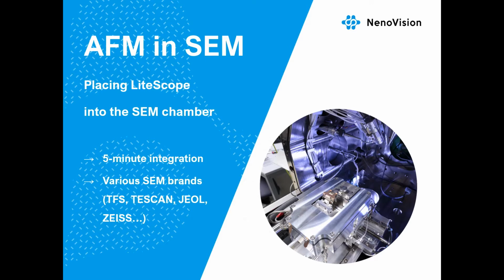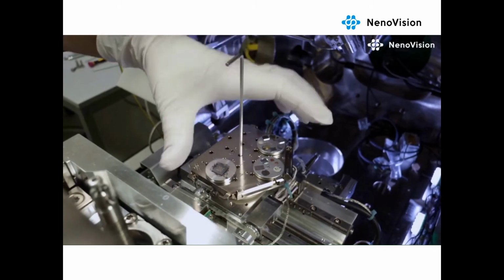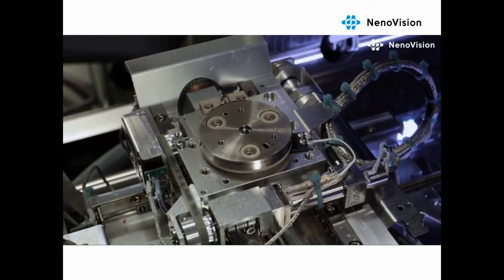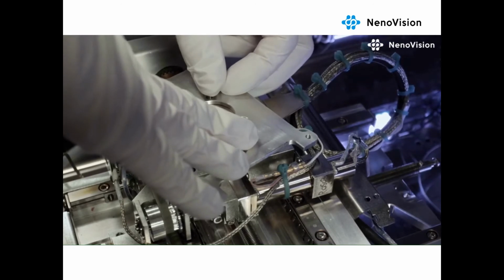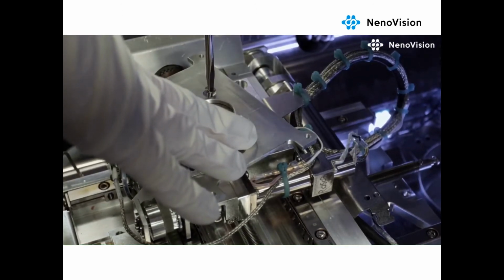Now let's have a look at how to do it. We are going to replace the SEM sample holder by LiteScope. First, we fix an adapter to the stage. The adapter differs according to the SEM brand used.